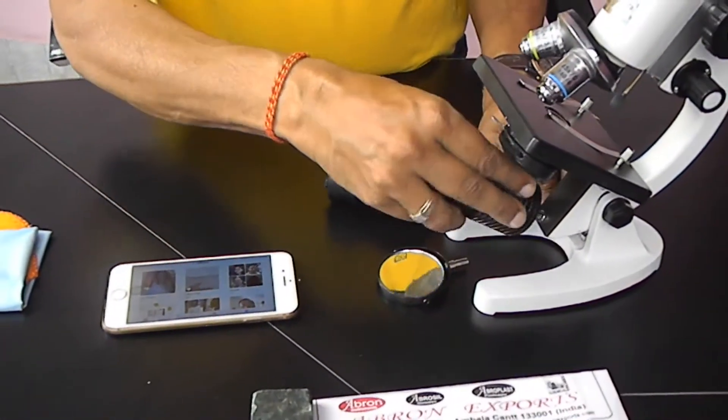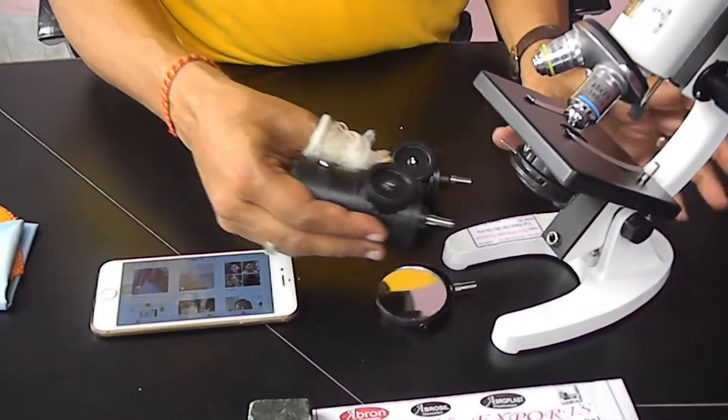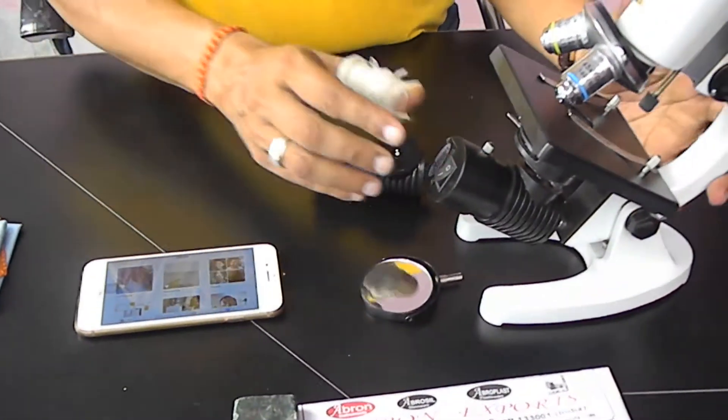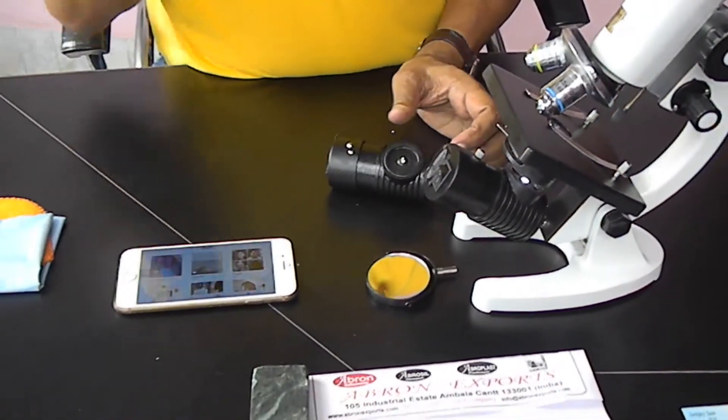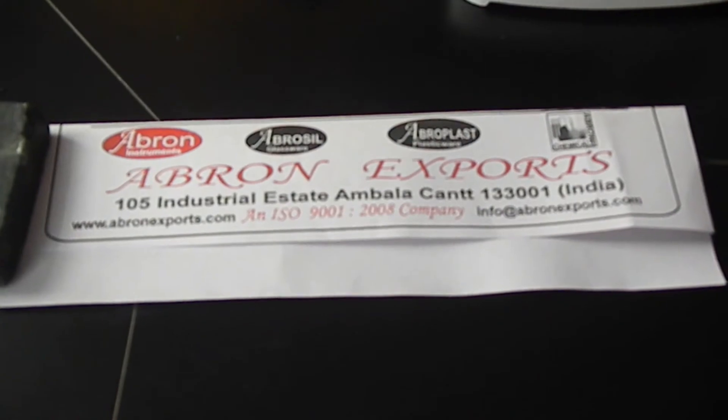Putting it in the microscope is very easy — just remove any microscope reflector and place it here. Please visit our website and send us an email at Abron Exports. Thank you very much.